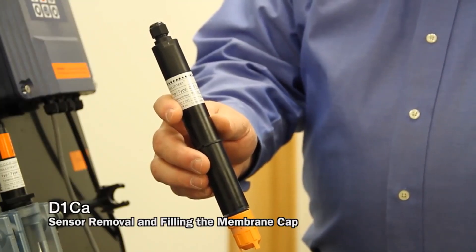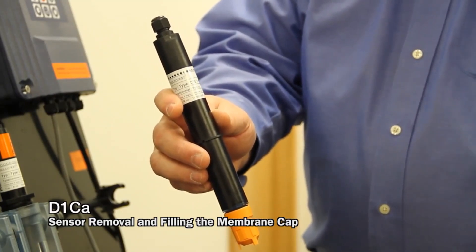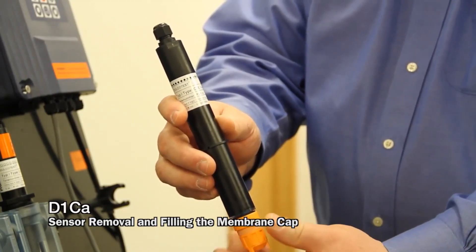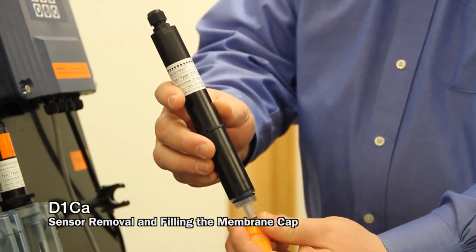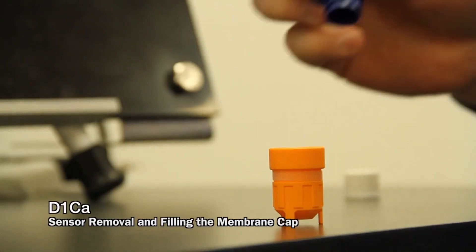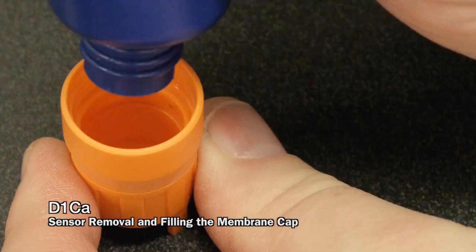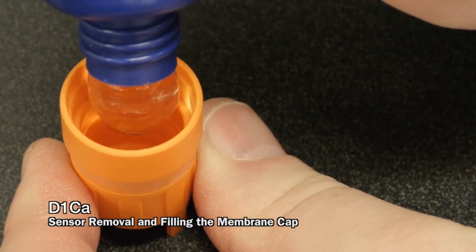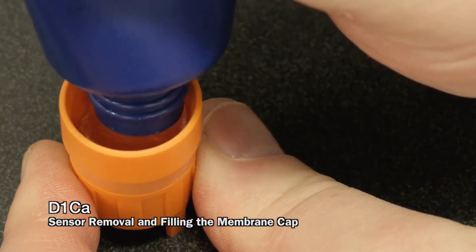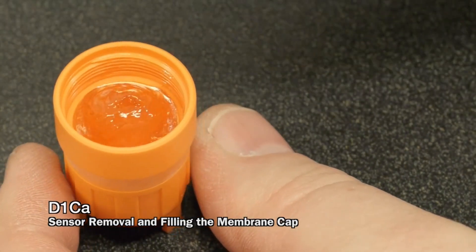Some sensors have an electrolyte that is a little bit more viscous. To change or add the electrolyte, again remove the cap. Fill that cap with electrolyte — here you can see how much thicker this electrolyte is — filling it so there are no air bubbles.